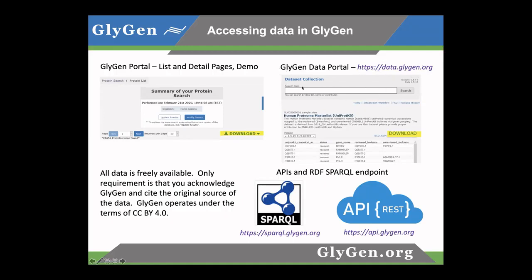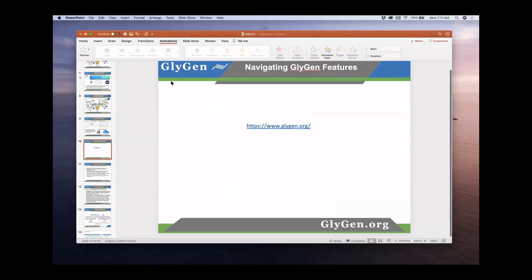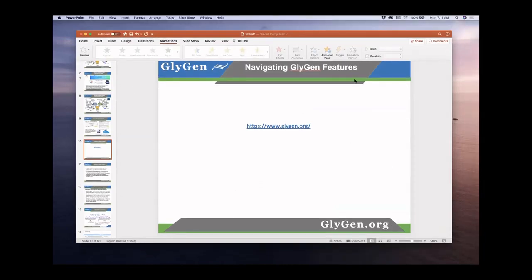I'll show you how to get there in a second, in the data portal, data.glygen.org, or through the web interface portal. So I'm going to go live now and hope that that works just fine. I don't see any reason why it shouldn't.